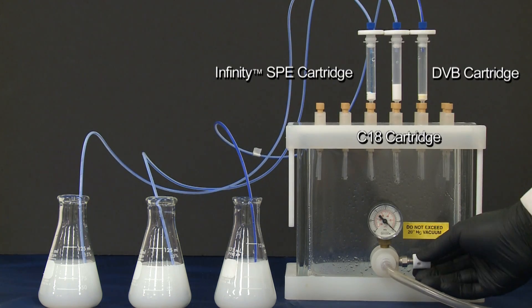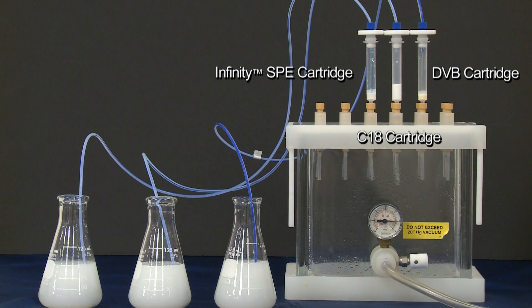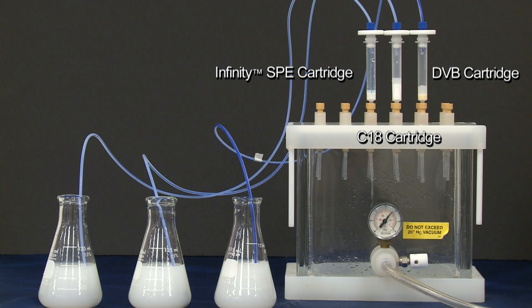Here, we are running a side-by-side comparison of the Infinity SPE cartridge and two of its leading competitors: a C18 media-based cartridge and a DVB media-based cartridge.